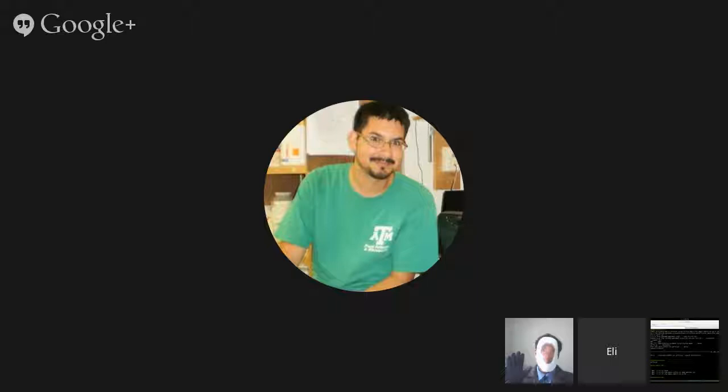Okay, so let's go back to STAR, and then go back to the documentation, copy this thing here so we can modify it. Oh, that's right, the built-in Chrome PDF viewer doesn't let you copy, I don't think. Rotate camera. It's STAR. Okay, yeah, I have it on the path. Minus run mode genome generate.